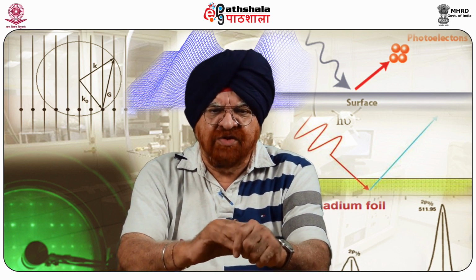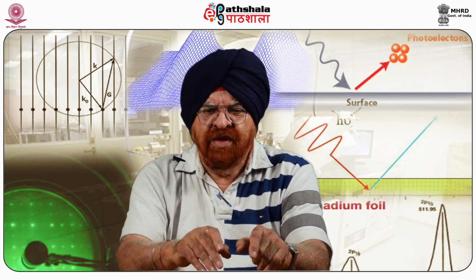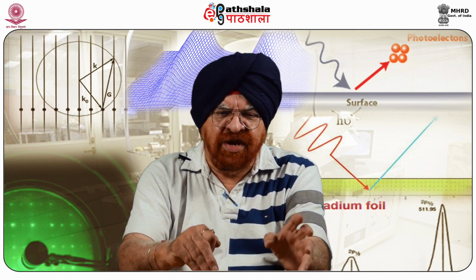The peak shape and precise position here in this spectroscopy indicate the chemical state of the element, which is not very difficult to understand.